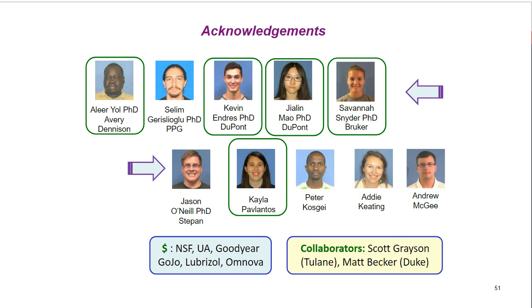Yeah, I understand the question. So usually, in very few cases does MALDI cause fragmentation. In most cases, all the things that you see are molecular ions. And if you want to cause fragmentation, you have to do that in the tandem mass spectrometry mode, if you deliberately want to do that. So even large or small oligomers have comparable stabilities. Remember, a polymer will tend to fragment if it has weak bonds. So if you form something by RAFT or by a polymerization method that contains carbon-sulfur bonds, then whether the mass is high or low, it's going to break.